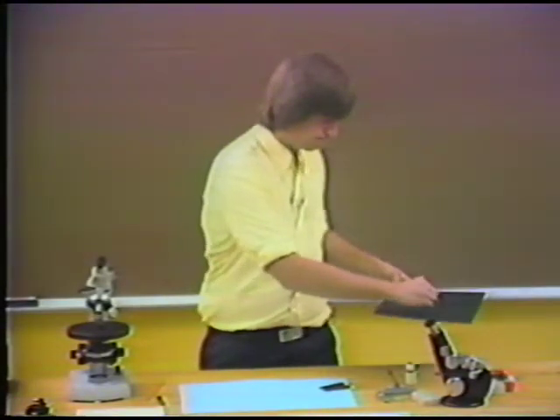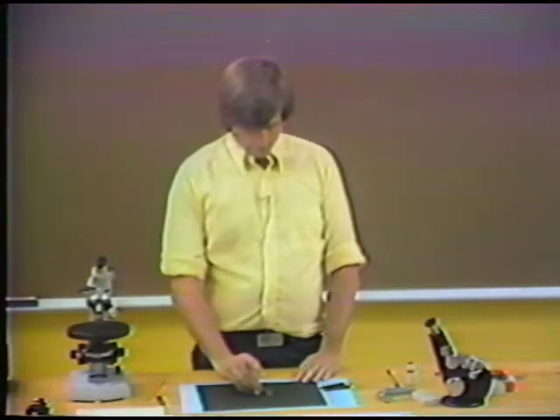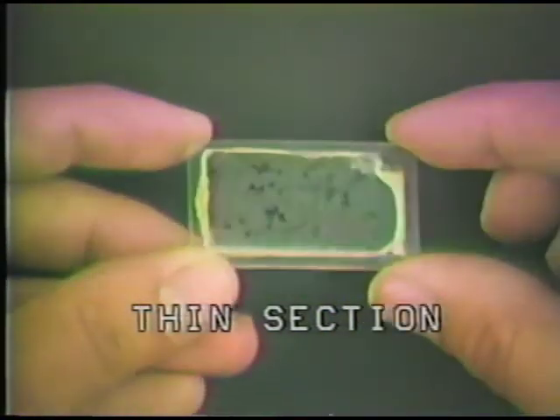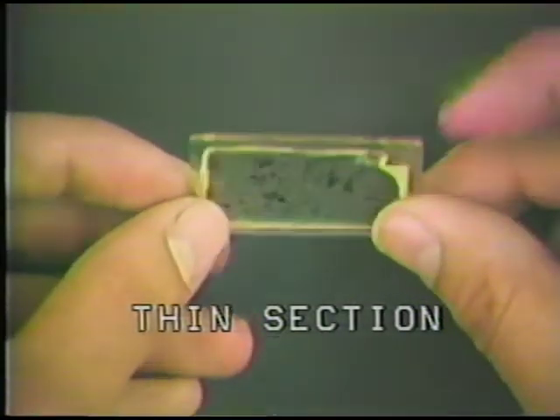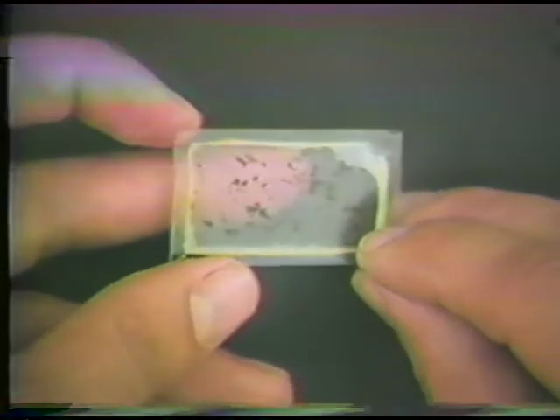The thin section preparation looks like this. It's a very thin section of rock. In fact, it's so thin that the material is transparent. You can see my finger beyond it.